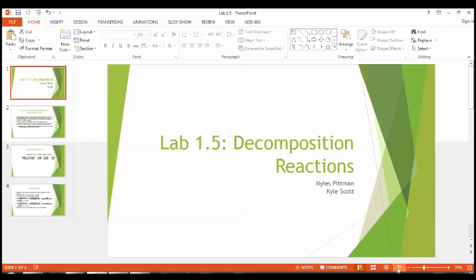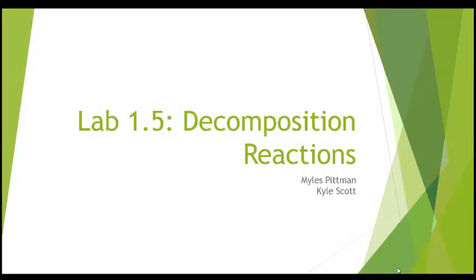All right, this is lab 1.5. Our topic is going to be decomposition reactions. My name is Myles Pittman. And I am Kyle Scott.